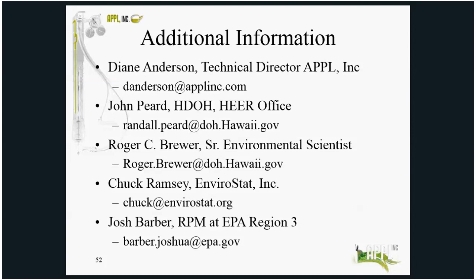Okay. Another question is, what type of documentation do you normally include in your data package? In the data package, we don't put any photographs. The photographs you would have to come back and ask, or ask up front to do that. But in the data package, we do include the SOP. We include the initial MIS size, the amount that was used, the triplicate results, and the name of the SOP.